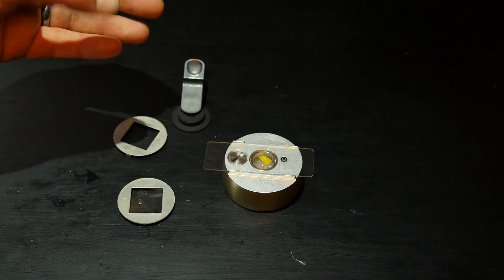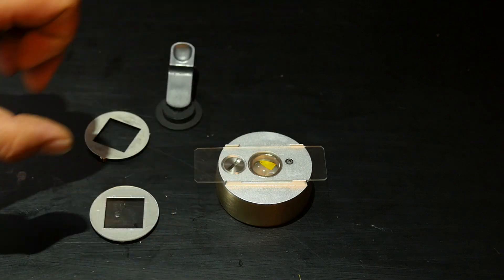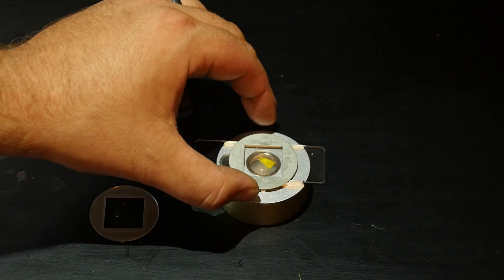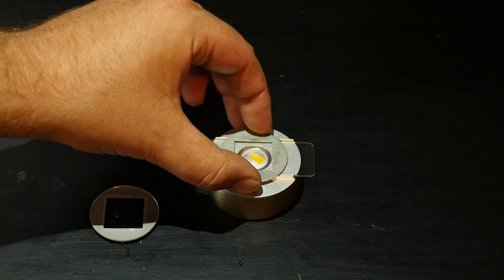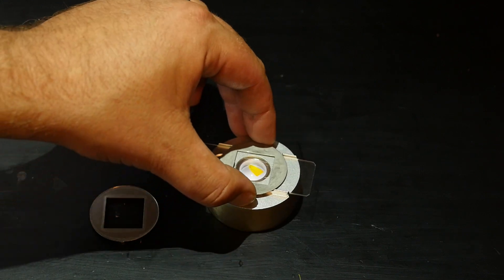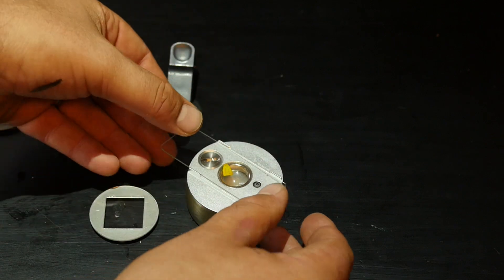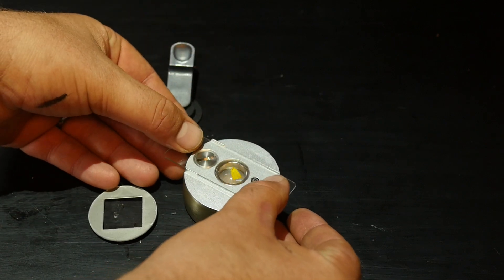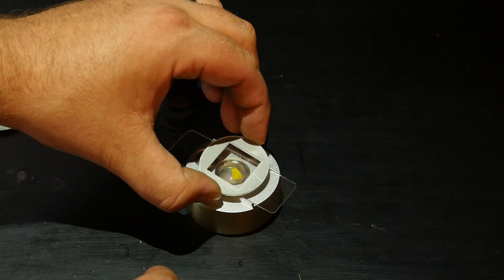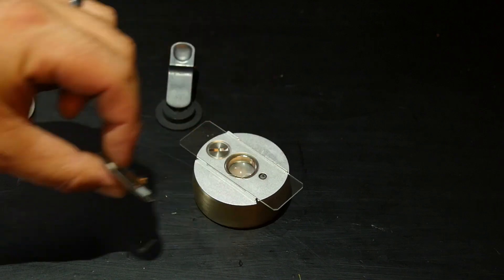I have a slide here with a little piece of a flower — I just grabbed it off one of the petals. You just place it on there, and once this goes down like that, it turns on the light. If I push down, you can hear a little tiny clicker that lets you set whatever you want to put on there, and then it will light up.